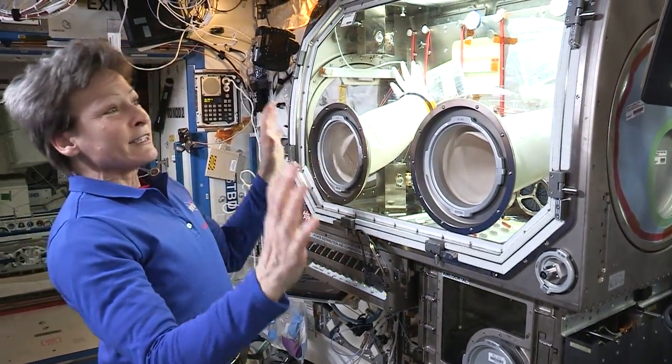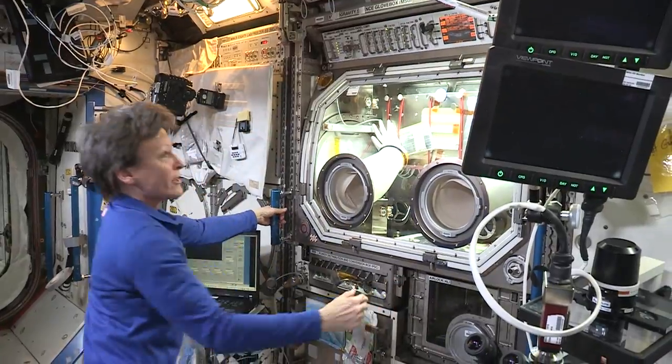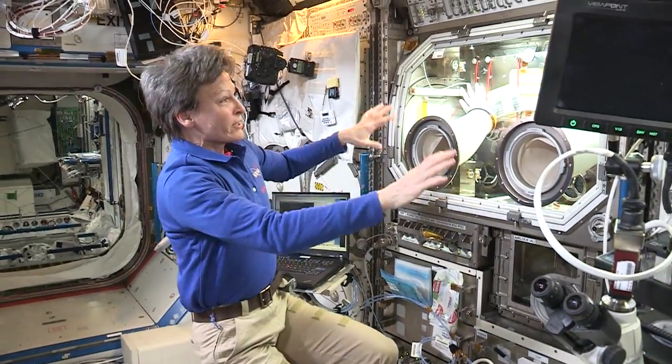It's kind of like a transformer. At the end of the day when you're done working with it, you just push it back into the rack — there we go — and it fits right in very nicely within the rack volume.